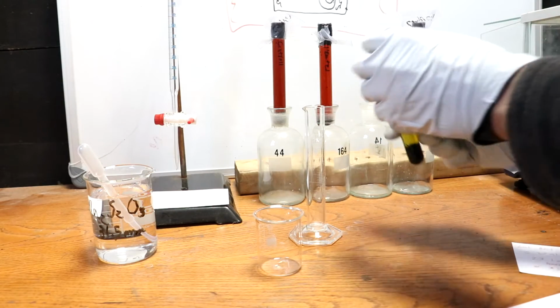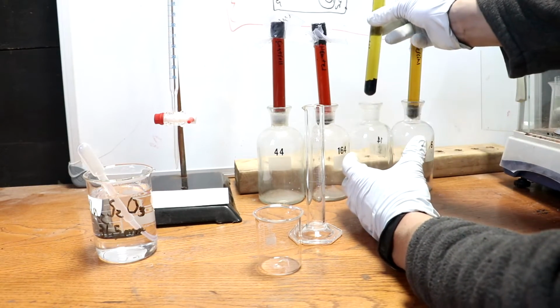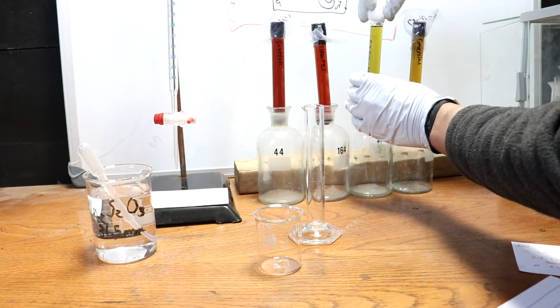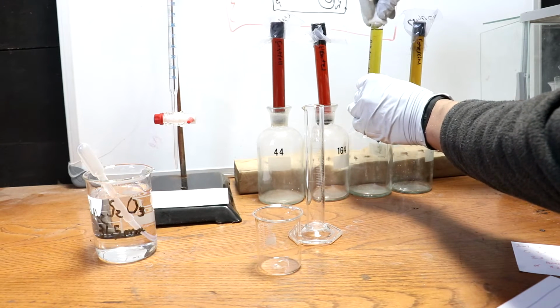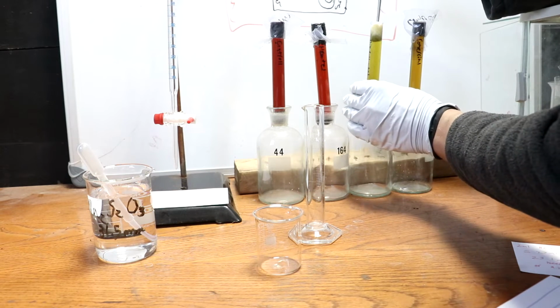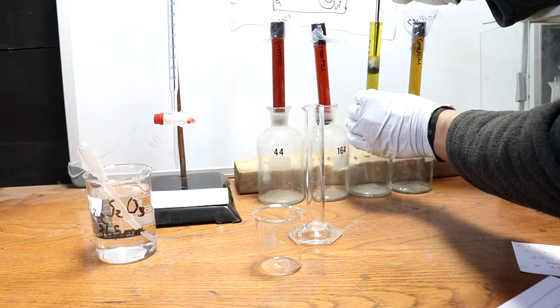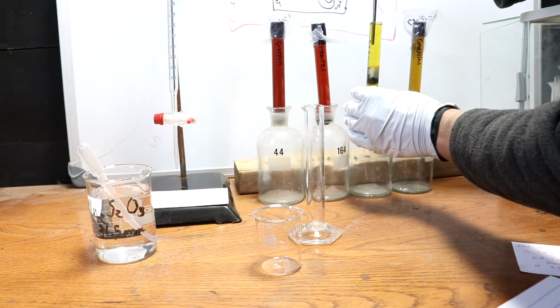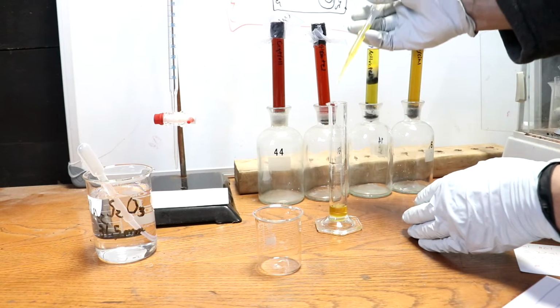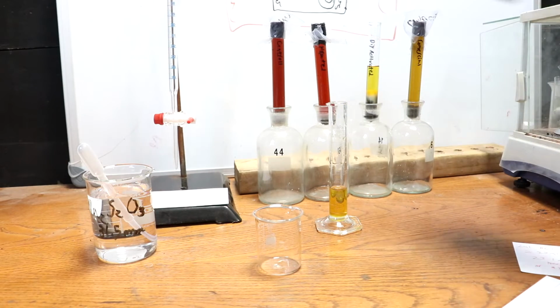So let's start with my activated carbon. Okay, and now I'm going to run a cotton ball down its throat in order to filter out any charcoal that's floating around in the solution. That could mess with my results. Let's push that down to the bottom. Oh, no. Might have to pull some out first. I'll use a pipette to transfer it. Okay, there's my 10 milliliters.